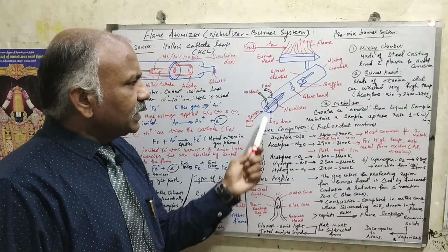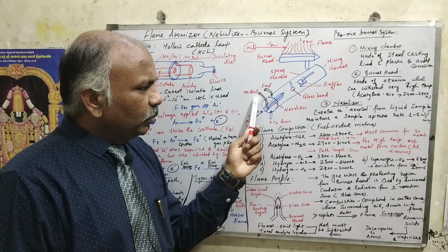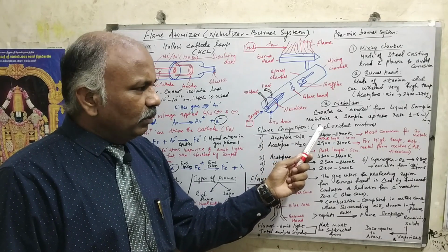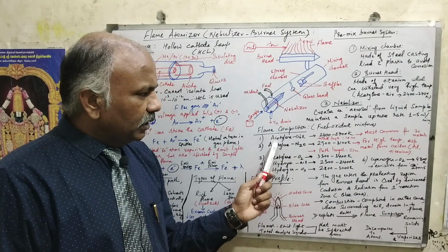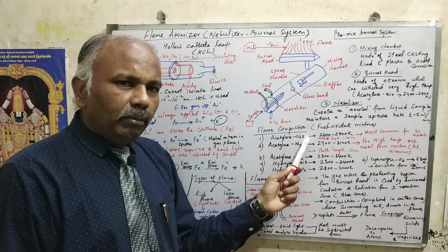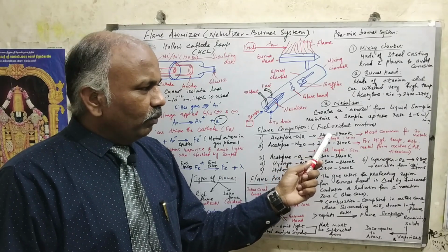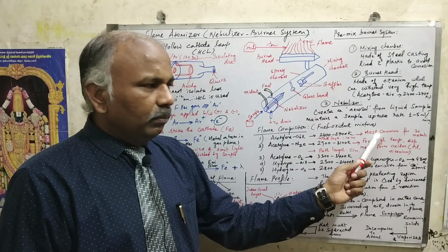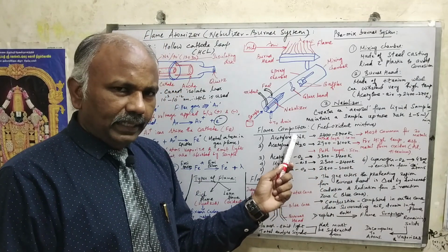Now what is this fuel oxidant mixture? How much fuel should we add, how much oxidant are we using, what type of fuel and what type of oxidant? These are the commonly used fuel oxidant mixtures. Acetylene air is the most commonly used fuel oxidant mixture, with a temperature of 2400 to 2700 Kelvin, and mostly for analysis of 30 elements we use the acetylene air mixture.